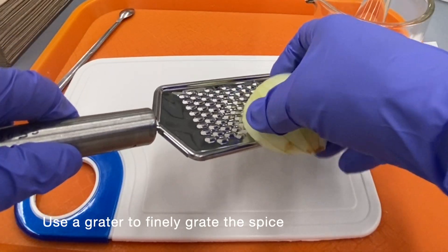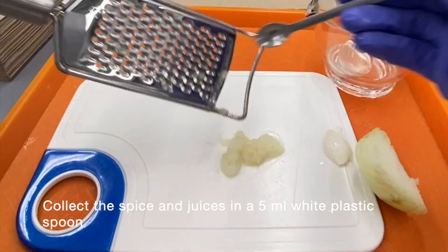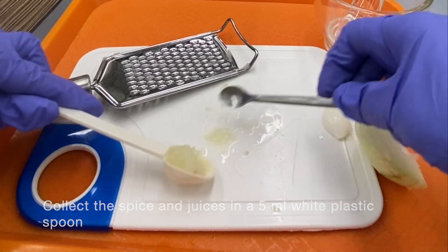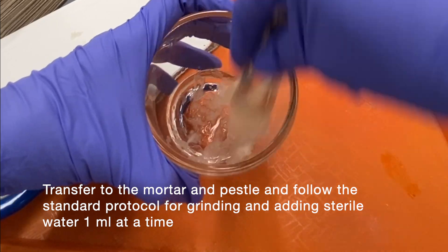Use a grater to finely grate the spice. Collect the spice and juices in a 5ml white plastic spoon. Transfer to the mortar and pestle and follow the standard protocol for grinding, adding sterile water 1 milliliter at a time.